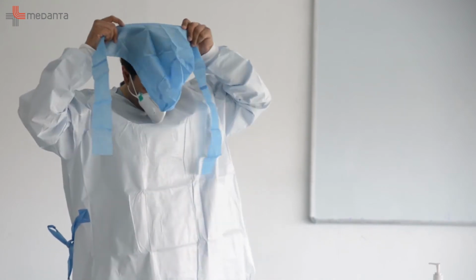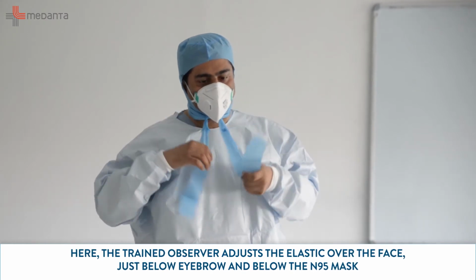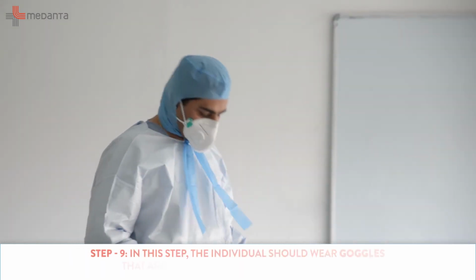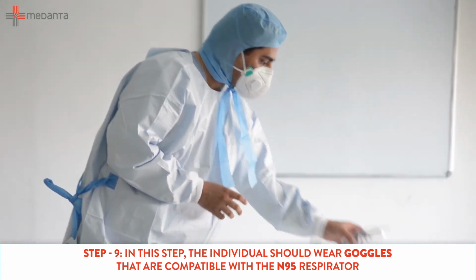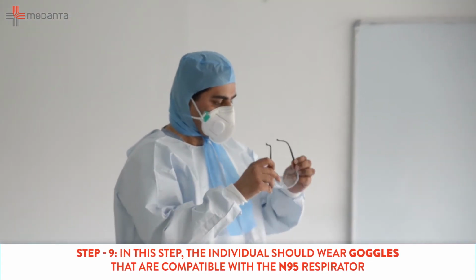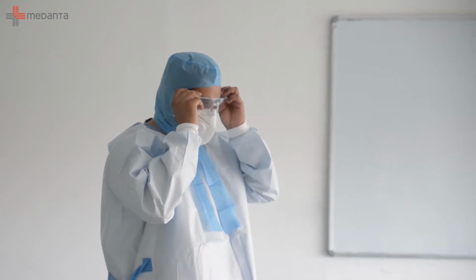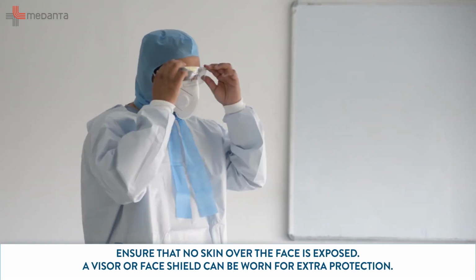And let it go over the shoulders and tie the straps. Step 9. Now wear the goggles that are compatible with the N95 respirator. These goggles have side protection so that droplets don't contaminate the eyes. Ensure that no skin over the face is exposed. A visor can be worn on top.